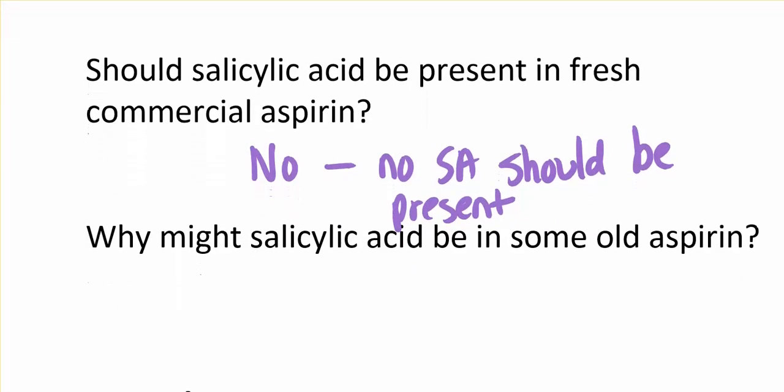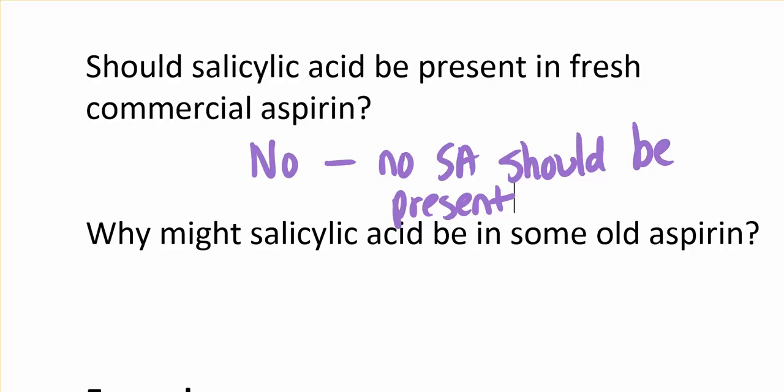Okay, what about if you had some old aspirin? Especially aspirin that's been stored for a long time in a moist environment.